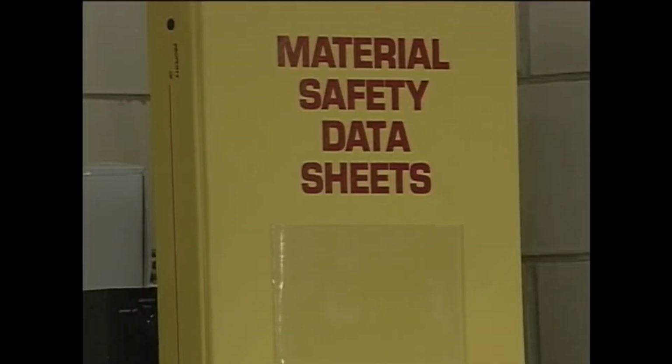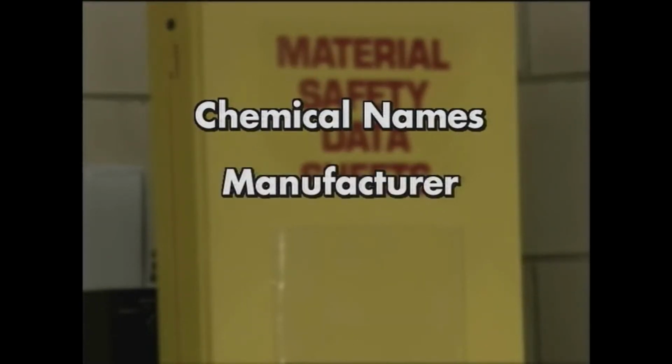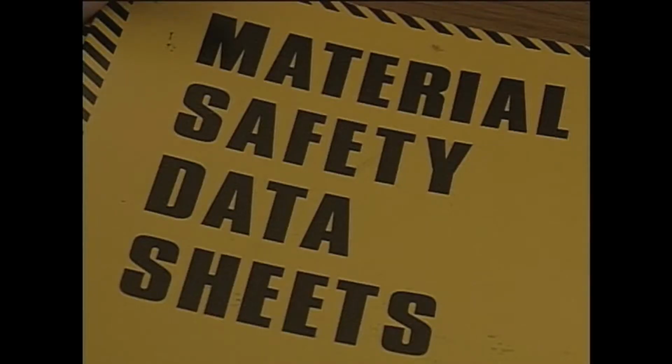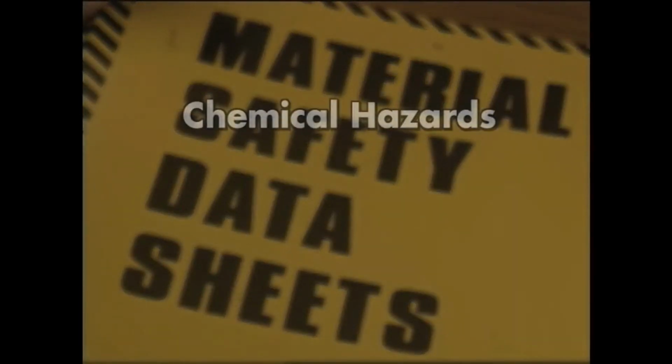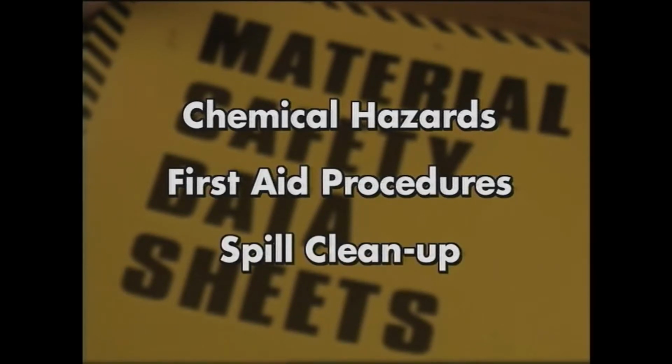The MSDS lists all of the names the chemical goes by, the company that manufactures it, and any hazardous ingredients that the chemical contains. The MSDS also describes the types of hazards that the chemical may present, first aid procedures for chemical exposures, as well as spill cleanup techniques.